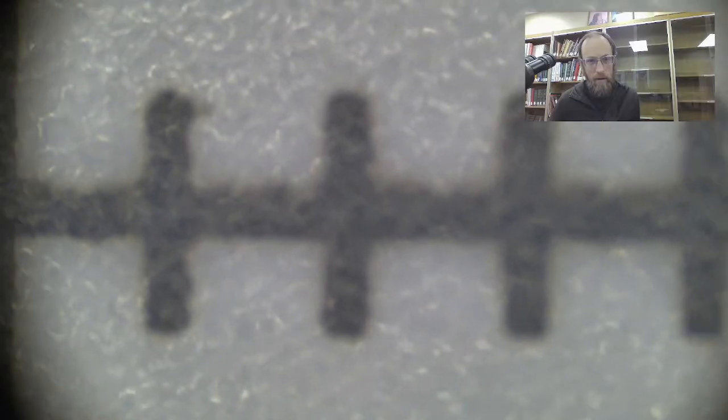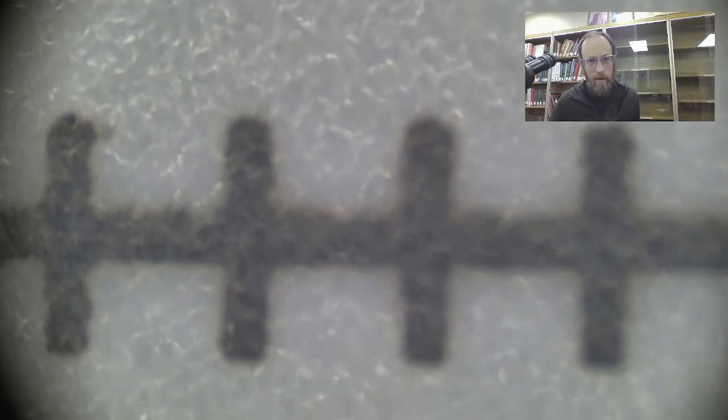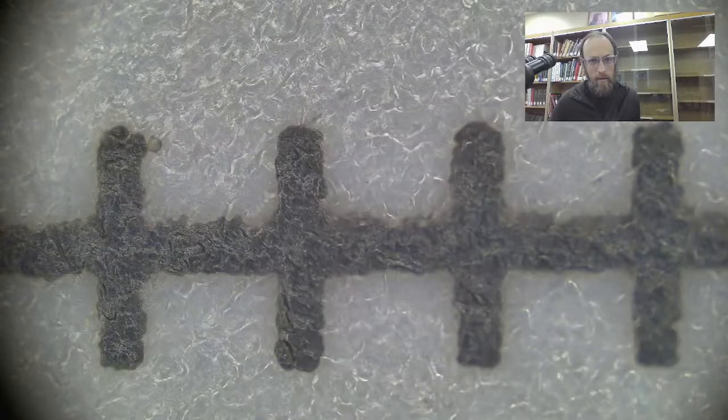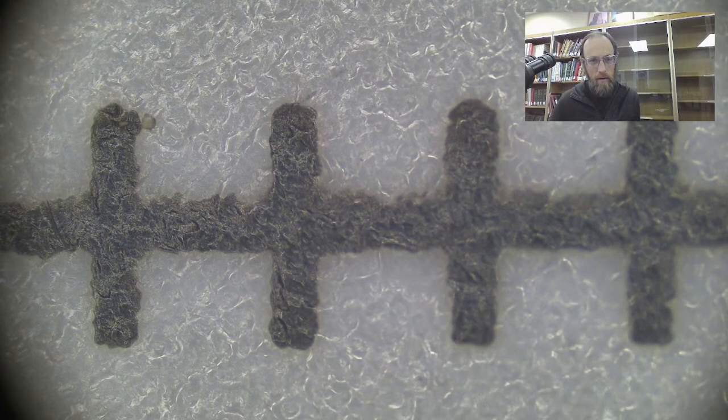I just like to have a consistent thing I can look at. These tick marks are millimeter tick marks, and there are going to be things of various sizes, but let's just put it right there.